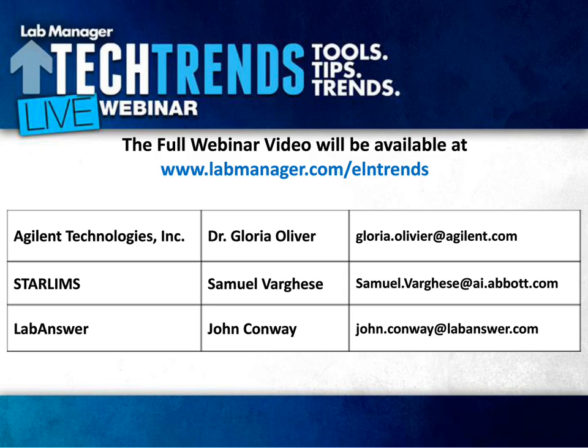It may be that what one person finds valuable in the ELN is different from another person, right? So find out for each role what would be beneficial for them, and then help them see from their perspective that it's either, one, going to help speed up the work that they do, two, somehow improve some other operation that they're doing, and really help them see that value. Because these tools are not just introducing change, they actually do streamline things and automate certain functions and help people in the work that they do as well.